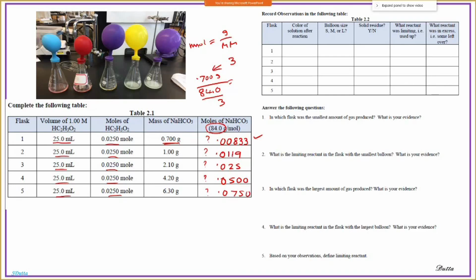The equation was vinegar, which is this. Now in your lab manual it is written in different ways. It can be read in many different ways. So this is the vinegar, which is acetic acid, plus sodium bicarbonate to make carbon dioxide plus water plus the sodium salt of the acetate, which is Na CH3 C double O minus. So I can write CH3 C double O.